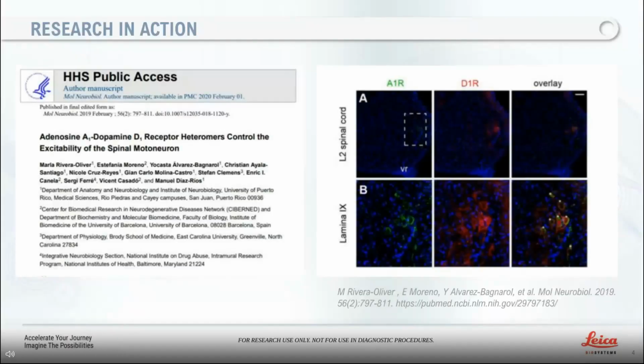During our session, I will provide you with some great cryosectioning hacks I discovered while working in the spinal cord injury and locomotion laboratory in Puerto Rico and help generate the quality data needed to publish this paper. I worked mainly with mice and rat brain and spinal cord tissues to understand how the intrinsic mechanism of action of the spinal network affected locomotion or the ability to walk under certain circumstances like injury, alcohol exposure, and even caffeine. To understand the physiology of the spinal network, I perform electrophysiology studies.